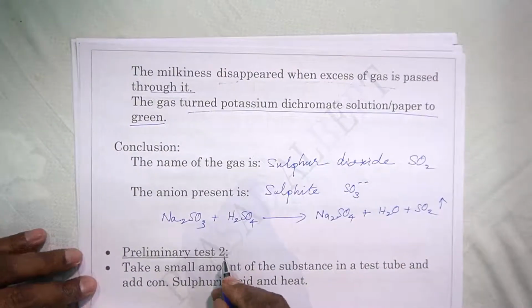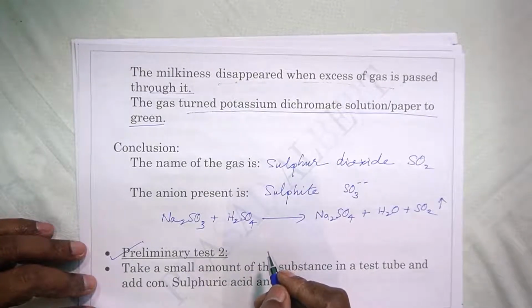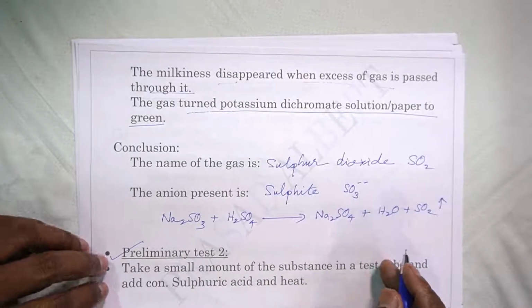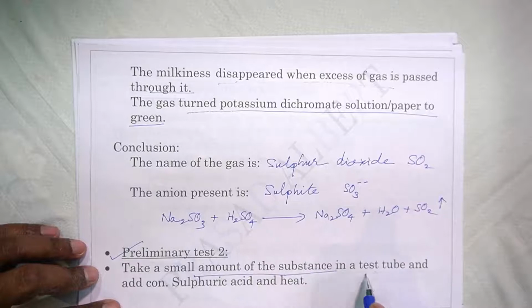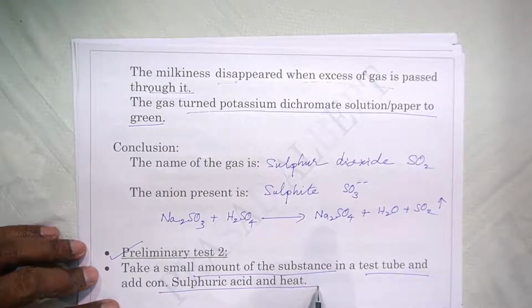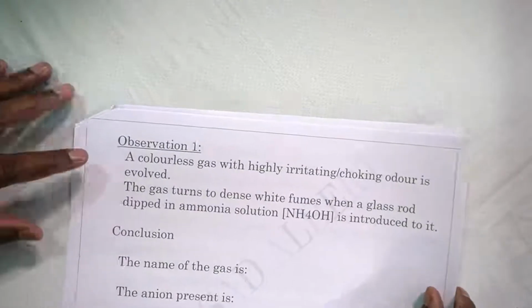Now we have the second preliminary test. This is for the anions which are identified by concentrated sulfuric acid. We take another test tube with a small amount of the substance. Now we add concentrated sulfuric acid and heat. What happens? Two observations are possible.